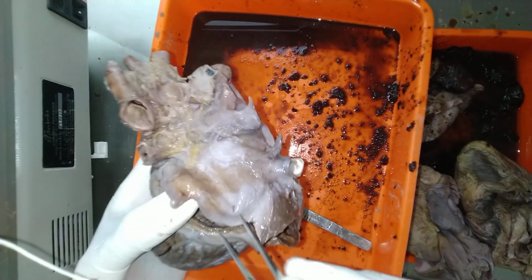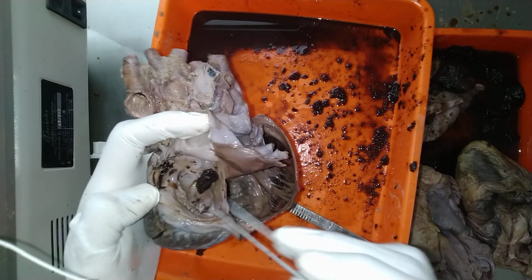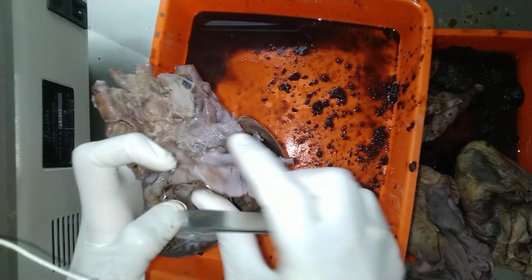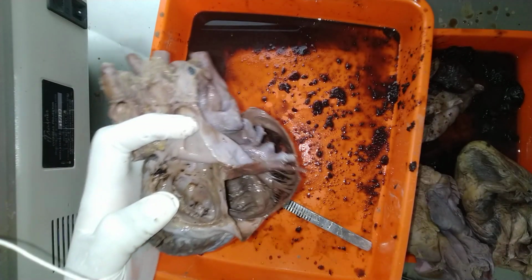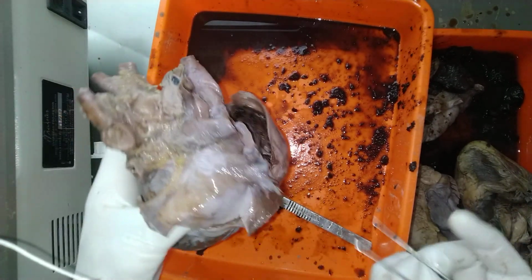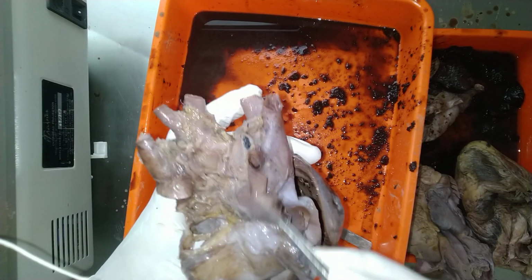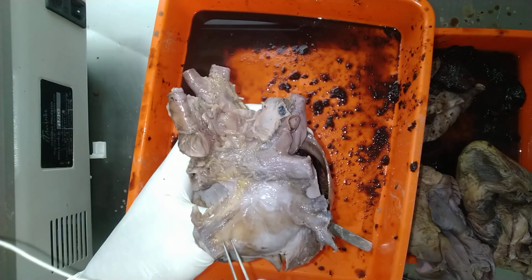Now let's open, so we have already opened the left atrium. The left atrium is more muscular than the right atrium. Its muscle wall is thicker than that of the right atrium. Even though most of the left atrium is smooth, in the smooth posterior part of the left atrium we have the openings of the pulmonary veins. So these 4 pulmonary veins, superior and inferior pulmonary veins, on the right and left sides.